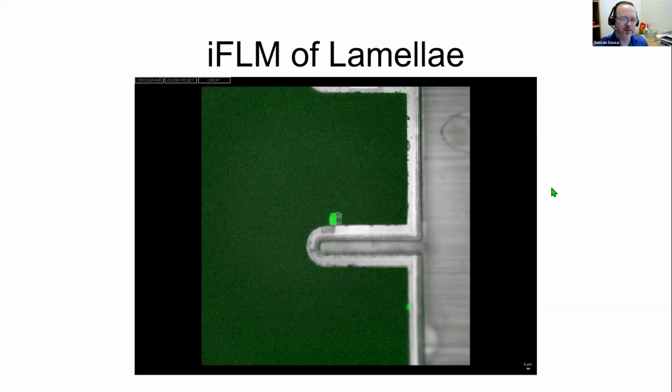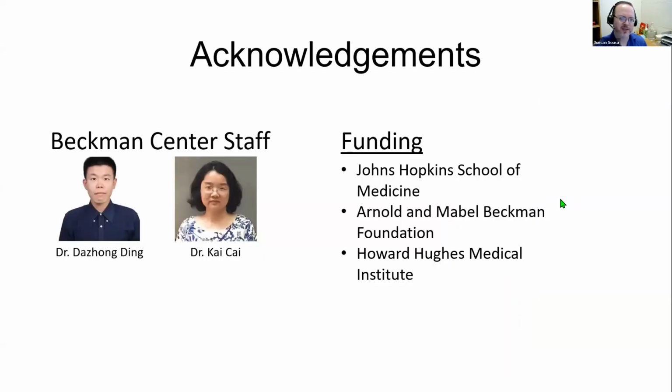It would be difficult to do sub-volume averaging unless you have a really dense targets sample, or you're willing to spend a week, but still it's possible.